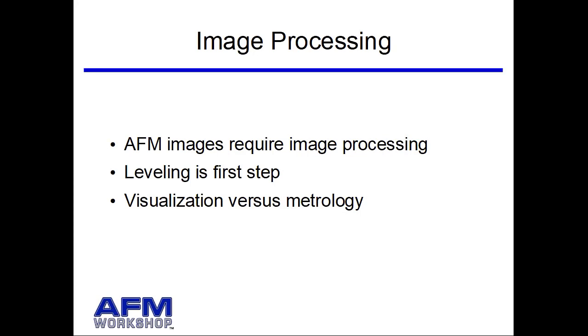And so the first step is always leveling. I want to point out that the type of image processing you do for visualization of a surface versus metrology is different, and the way you would treat the data is very different. With visualization, you're trying to create a graphic illustration of the surface to show somebody what you think your graphene looks like.